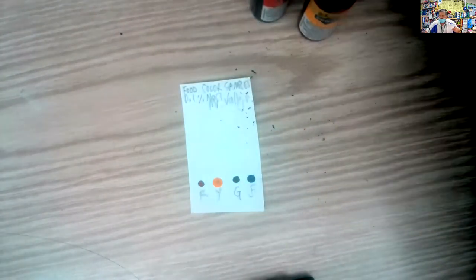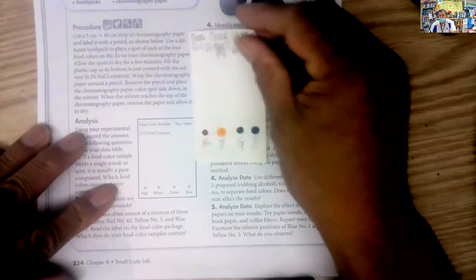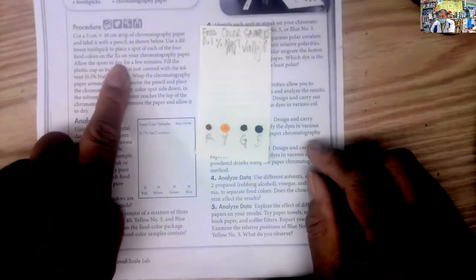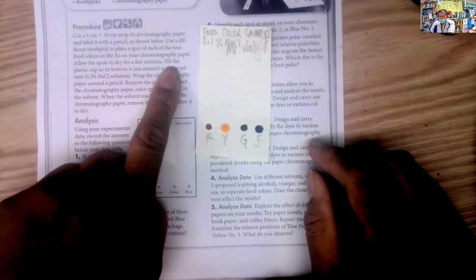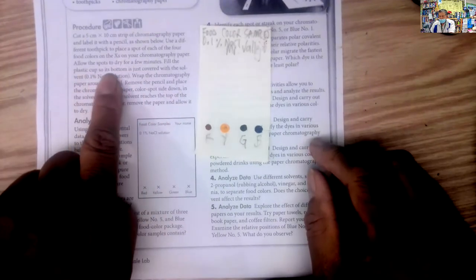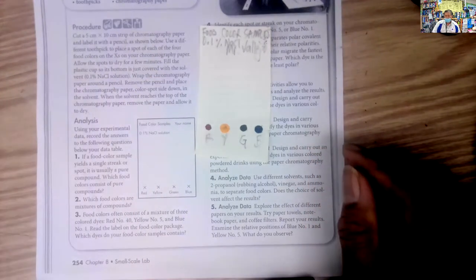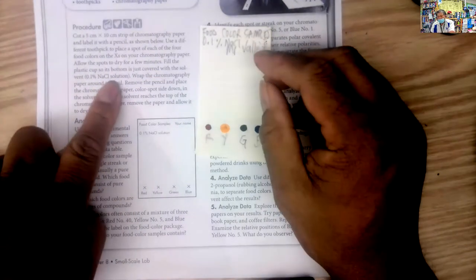While we're doing the other parts, we're going to let this dry. We'll move this off screen for us and then take a look at the instructions again. Where are we? We are right here. Allow the spot to dry for a few minutes. Okay, in the meantime, it says fill the plastic cup so its bottom is just covered with the solvent. The solvent is 0.1% sodium chloride solution.